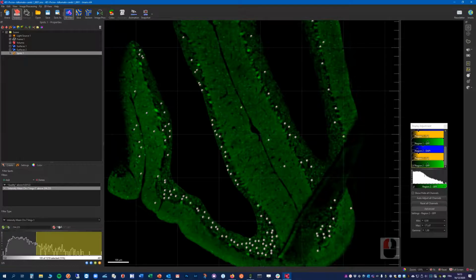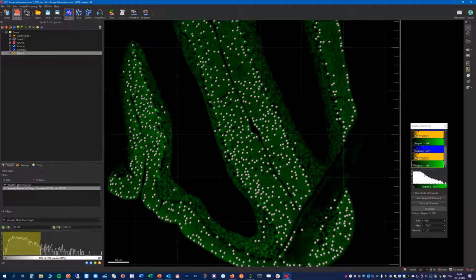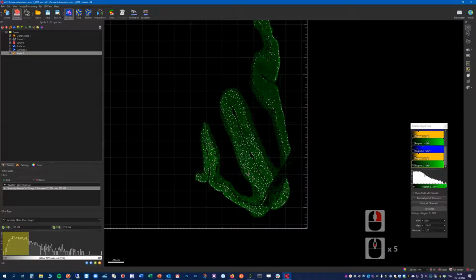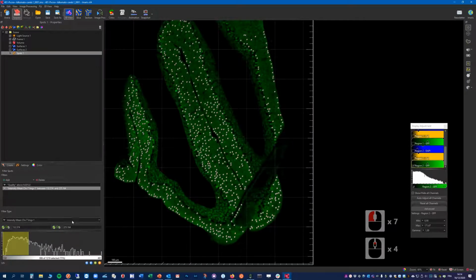And so here we have the reverse of what we want. So let me enable everything with the left mouse click, and with the right mouse click I disable the high part here. As you can see, we are progressively removing spots that are not needed in this case. Let's see roughly what it looks like. The on-off toggle allows me to see the effect of the filter. So I think it worked quite nicely, so I will stick with this for the moment.